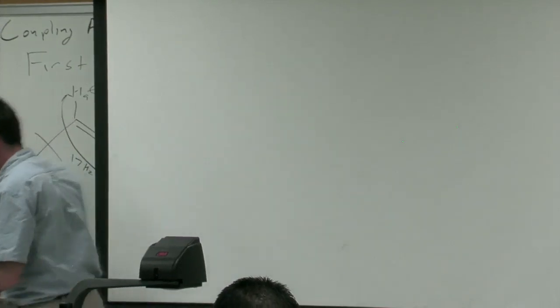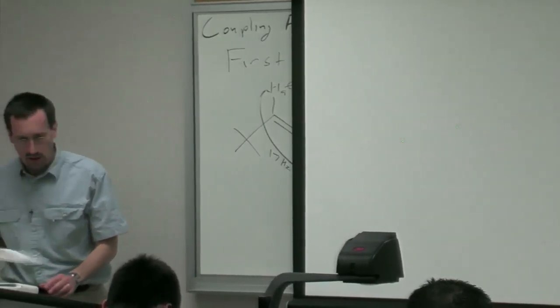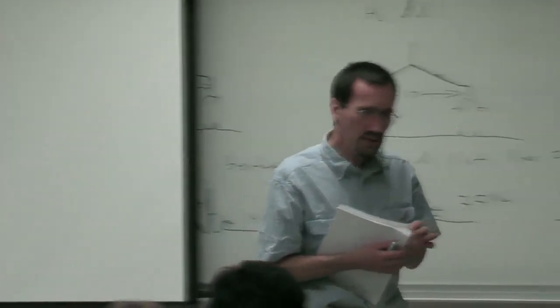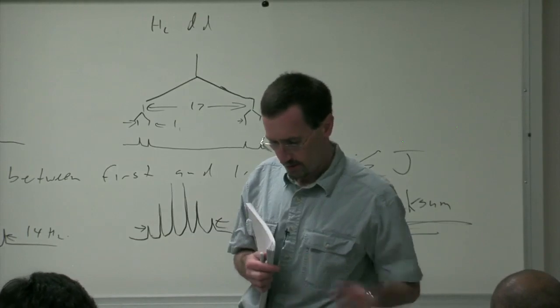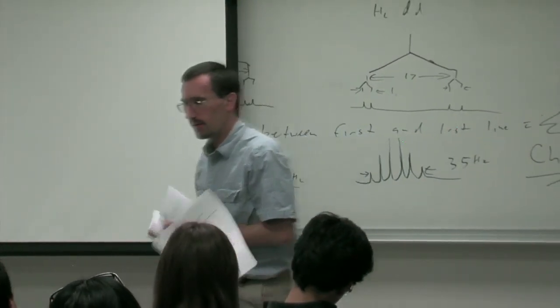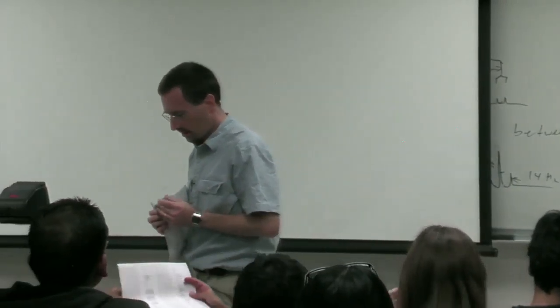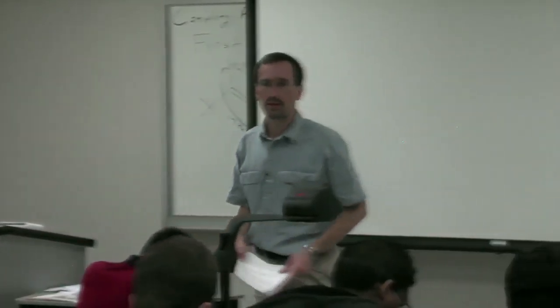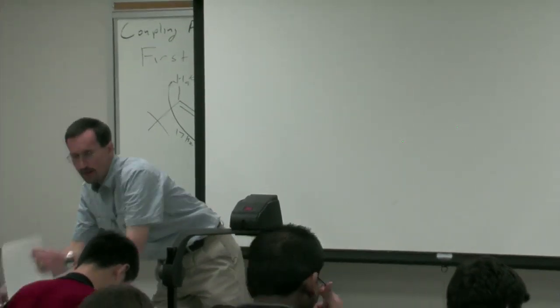All right, let's try some more multiplets. I'll show you another thing that's useful in just a second, but what I'm going to do is give you a handout that has some simulated multiplets. And I'll show you where I got them in just a second. But we can analyze them. So the best way to really get an understanding of something is to work through it.